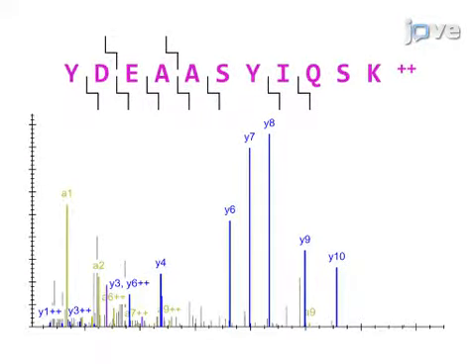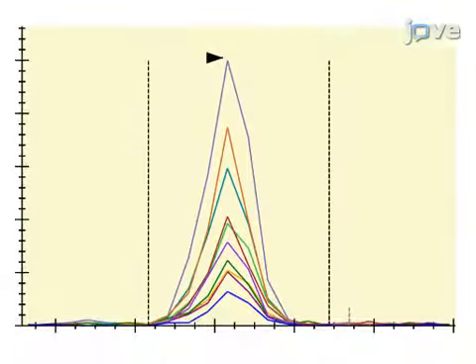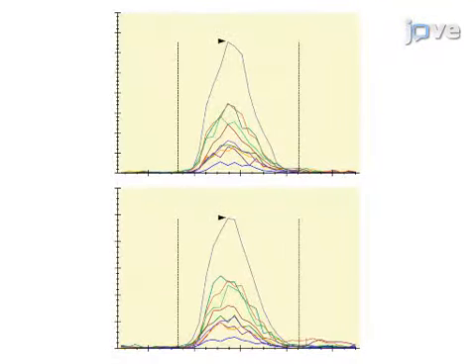Following selection of peptide targets, crude external peptide standards are synthesized and used to develop SRM assays using liquid chromatography mass spectrometry, or LC-MS. The resulting assays are used to perform qualitative LC-SRM analysis of prepared biological samples. If the biological sample-derived target peptide is detected, the biological samples are analyzed using quantitative LC-SRM assays by adding a stable isotope dilution series of internal peptide standards.